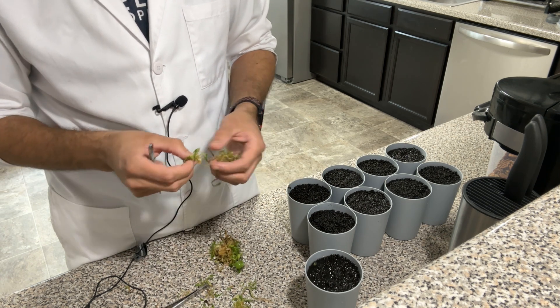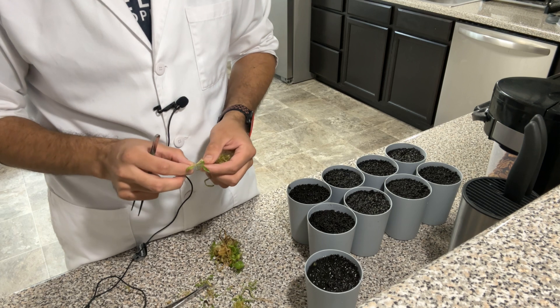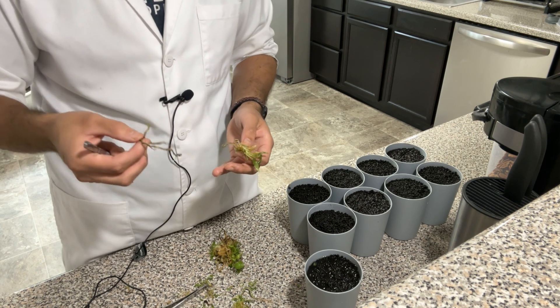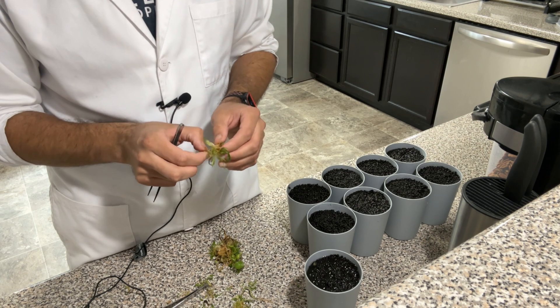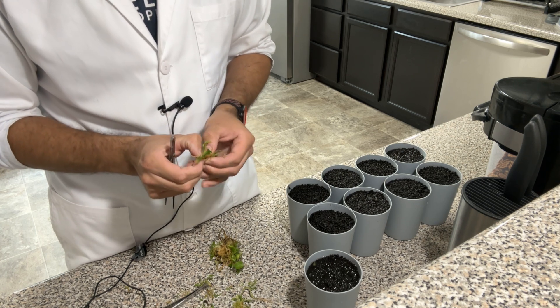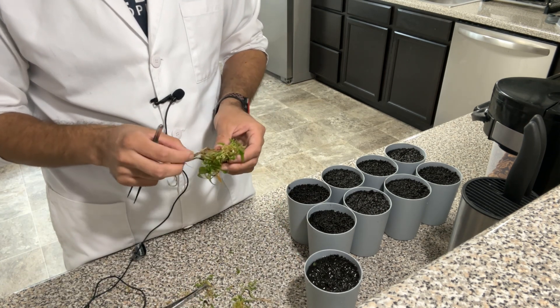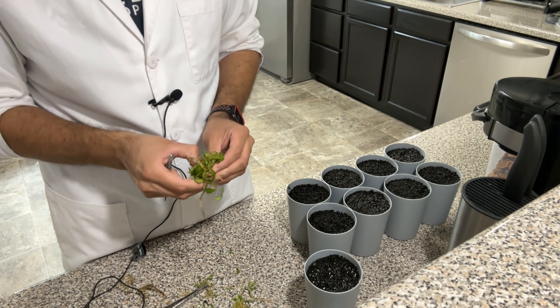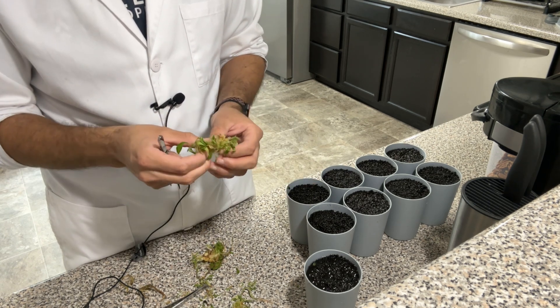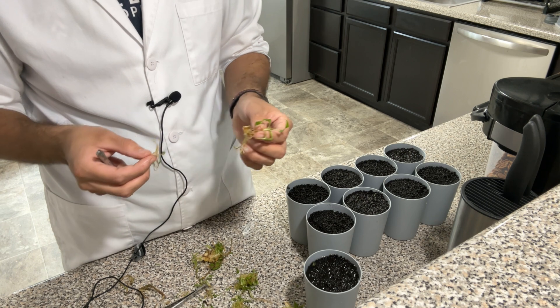The biocoupler combined with fluval stratum is a great combination. A lot of people know about using fluval stratum for rooting cuttings — not just tissue culture plants, but even expensive plants you want to be super careful with. Many people have really good success using fluval stratum to root plants. Combined with the biocoupler's oxygen exchange, this really increases your success rate.